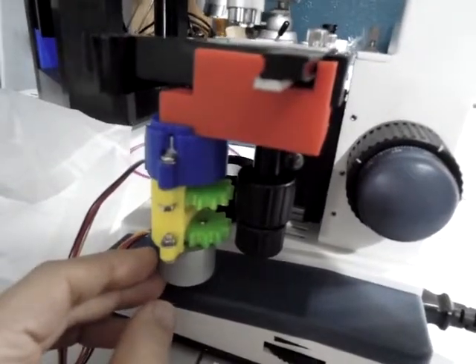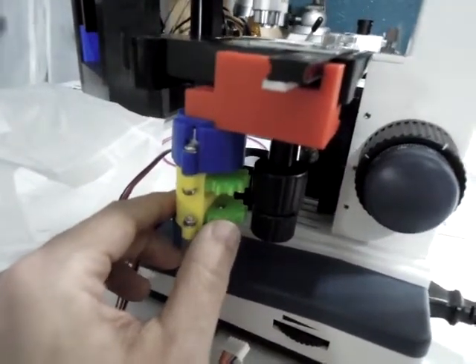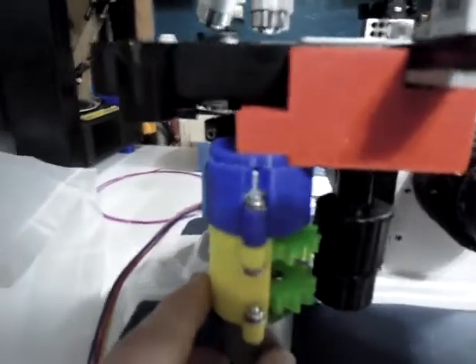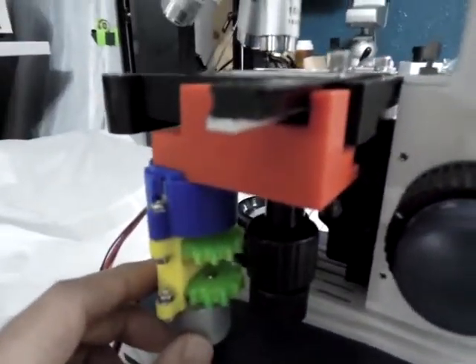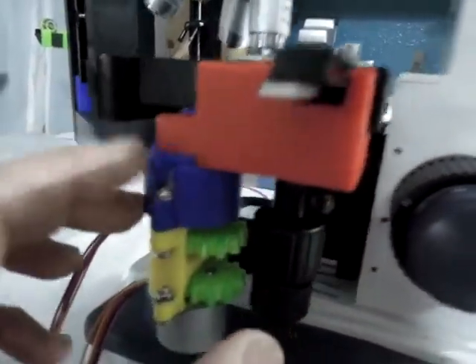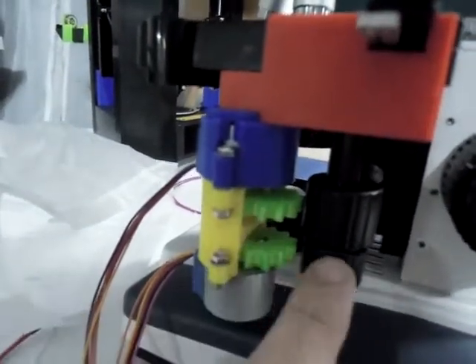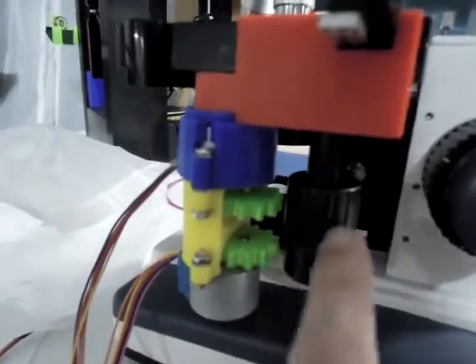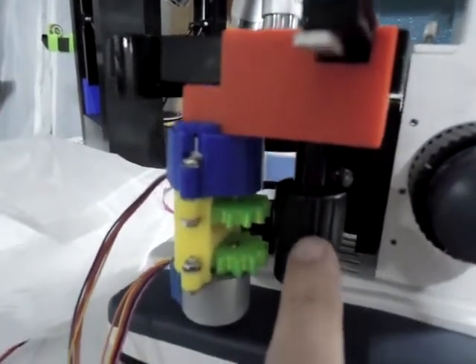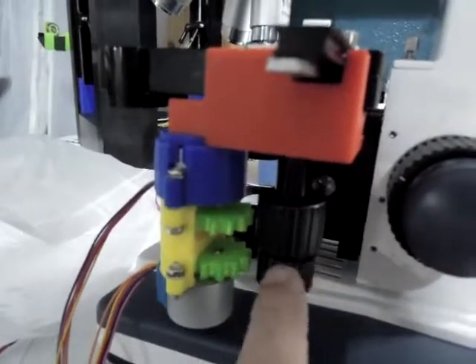This is the very interesting design that someone posted on Thingiverse a couple years ago. Unfortunately not updated, but fortunately it attaches to the scope absolutely perfectly. The red part here is, right now, even press fit — it's tight enough that it's holding on its own. There's a little geared stepper motor here, and then another one here, and then these two gears. There are supposed to be gears that get attached to these knobs, but unfortunately my knobs are a slightly different size than the original design.